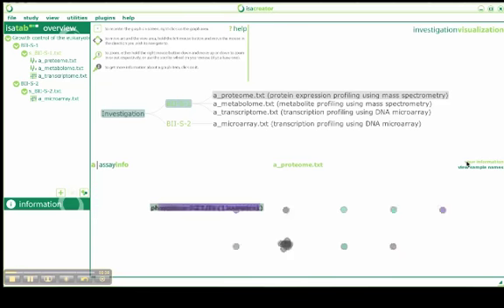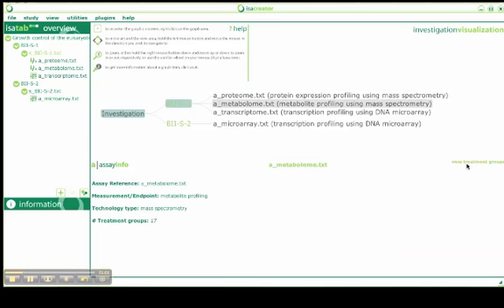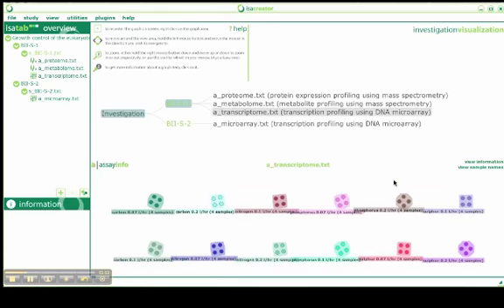Now we click the View Treatment Group button, and we've got this layout indicating how many samples for conditions are available. As you can see, for this condition, we've got a number of elements which probably correspond to the control, but for some of the values, we only have one element, which indicates poor replication. For the metabolome, for instance, we have a better indication where more samples were available for every time data point or condition, and the same for transcription. It seems that we've got a balanced design where good statistics could be drawn with 4 replicates. It's reasonably good.